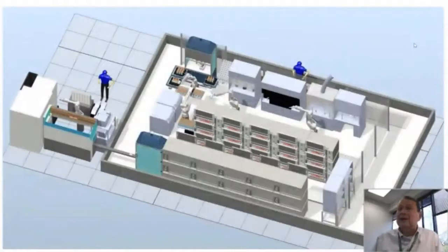This is the diagram of the production facility for 1,000 maxi preps a day. And what you can see in this robotic line is the use of these five-axis arms on tracks. And roughly what's happening here is this is the loader. This is where your sample comes in from your company. We store it in the freezer. We then prep it into a glycerol stock, which we load into an inoculation chamber, which inoculates all the bottles you see in all these incubators. These are taken out at intervals. They're centrifuged. And then we use this to produce the plasmid prep in this production line.